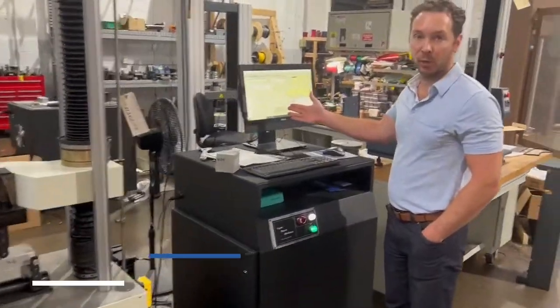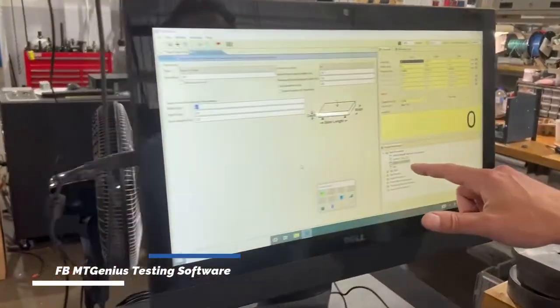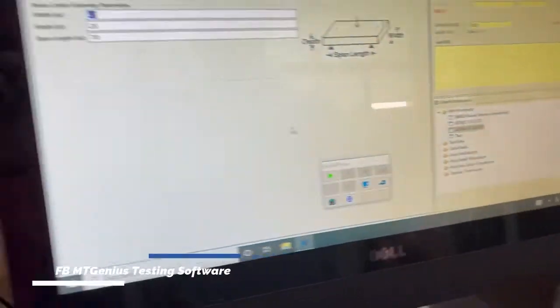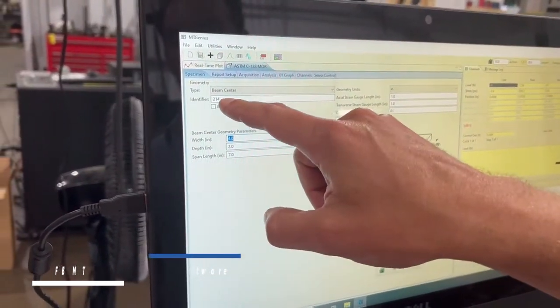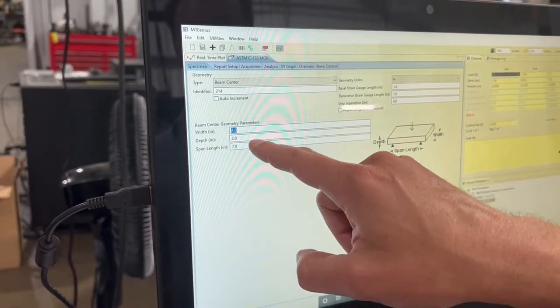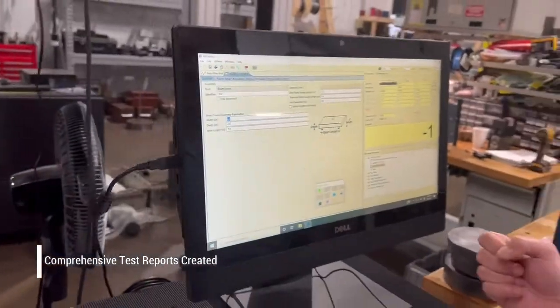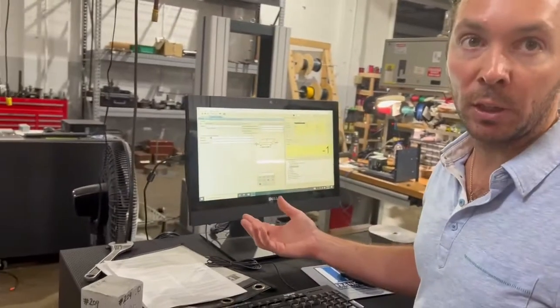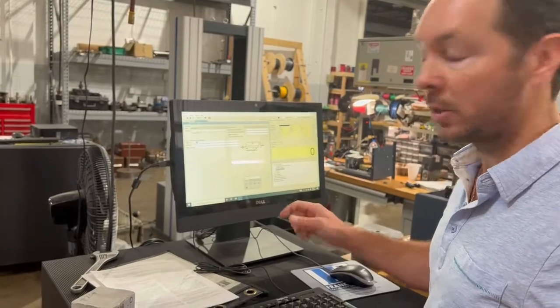I got the MT Genius software already pre-set up for the ASTM C133 MOR testing. This is a three-point bend test. It's a beam center. This is our specimen ID. We got a specimen width of four inches, a depth of two inches, and a span length of seven. It's going to use that geometry and span length to calculate the modulus of rupture, which is a stress value given at the end of the test. And it's going to give you a full graphical test report. Let me show you how it's done.